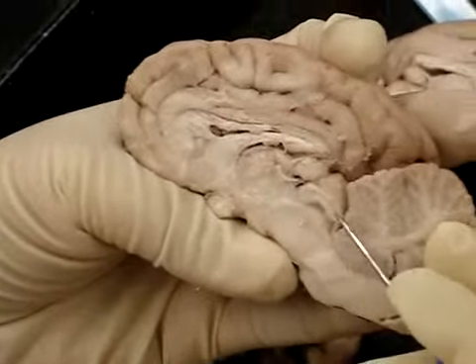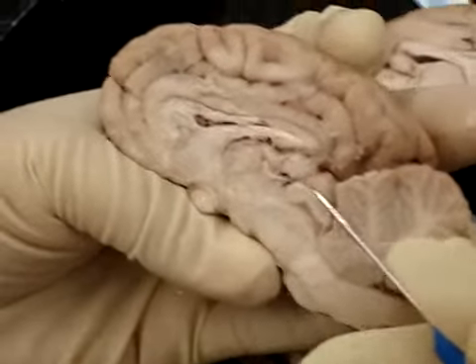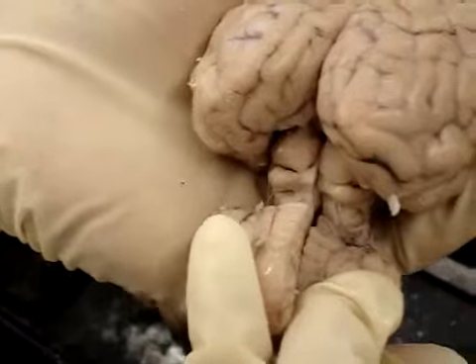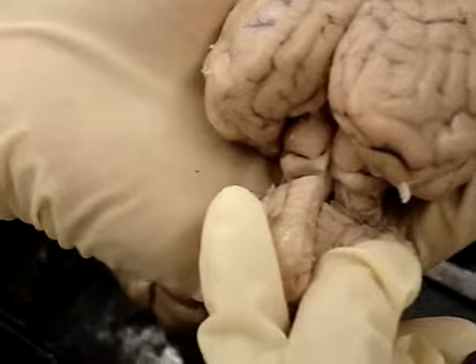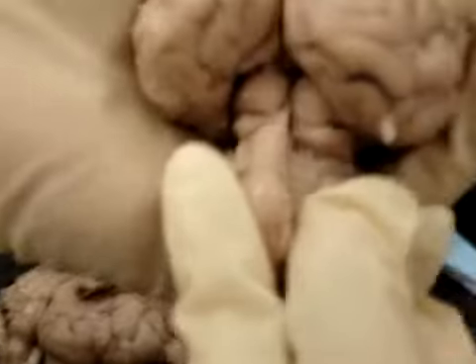Above it is the inferior colliculus, and above that is the superior colliculus. And if you put the two halves of the brain together and you look down, you can see those four, it looks like four bumps. The top two are the superior colliculus, and the bottom two are the inferior colliculus.